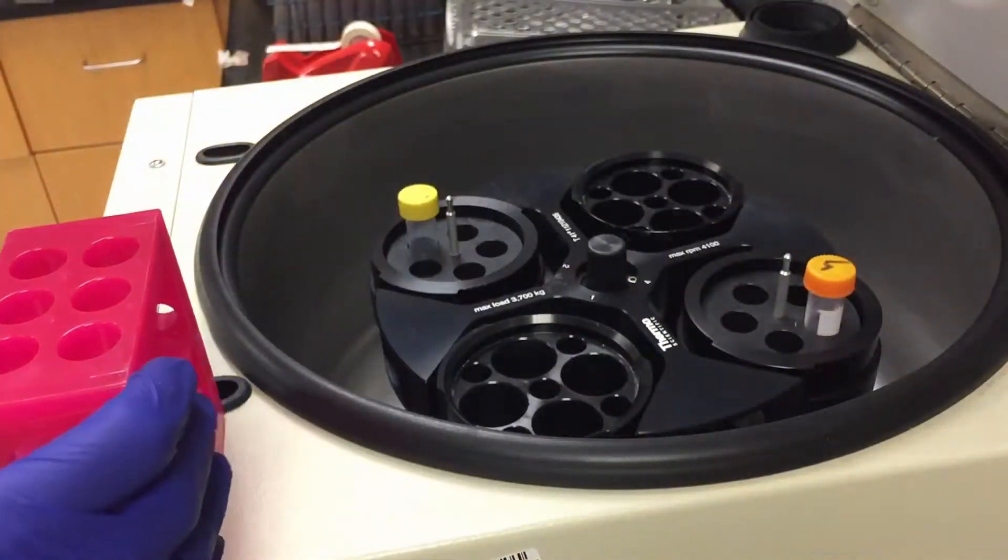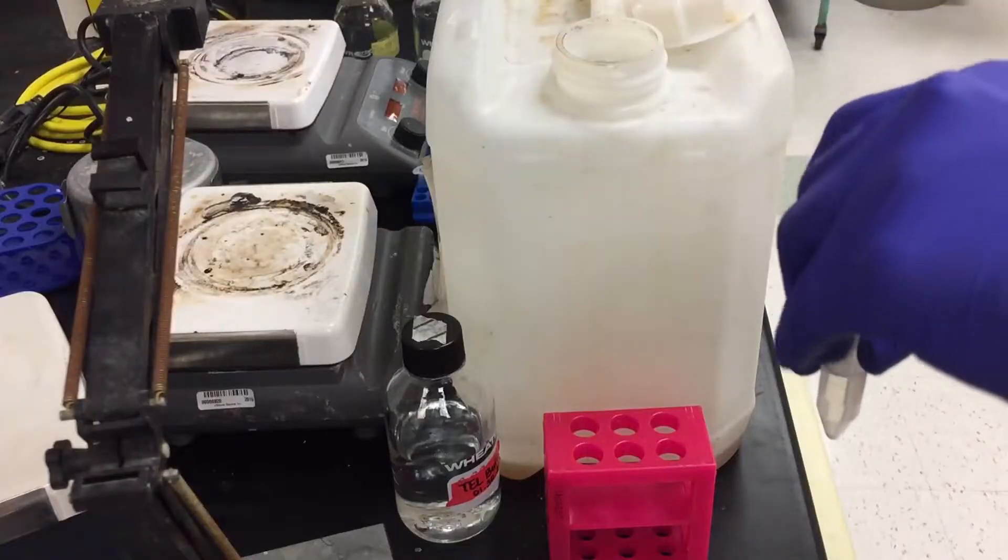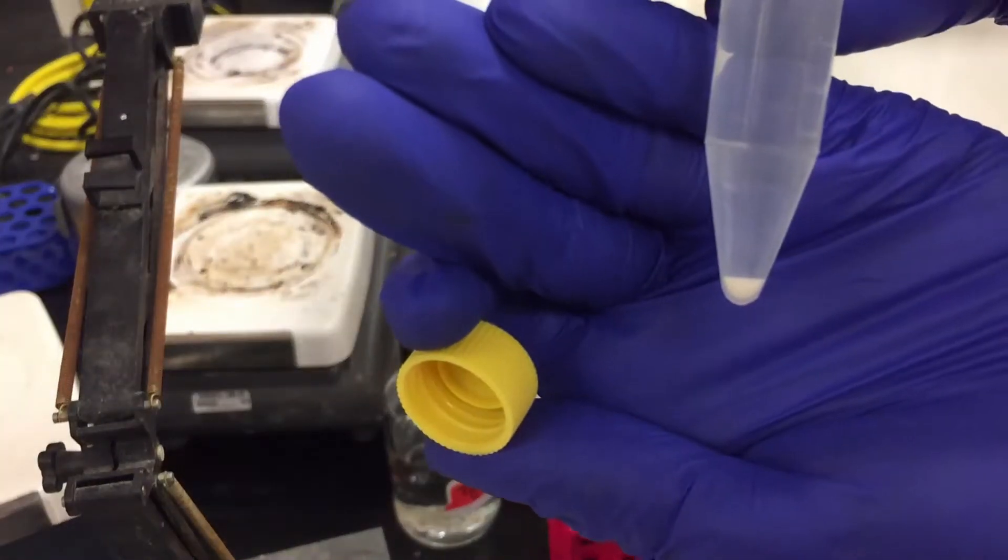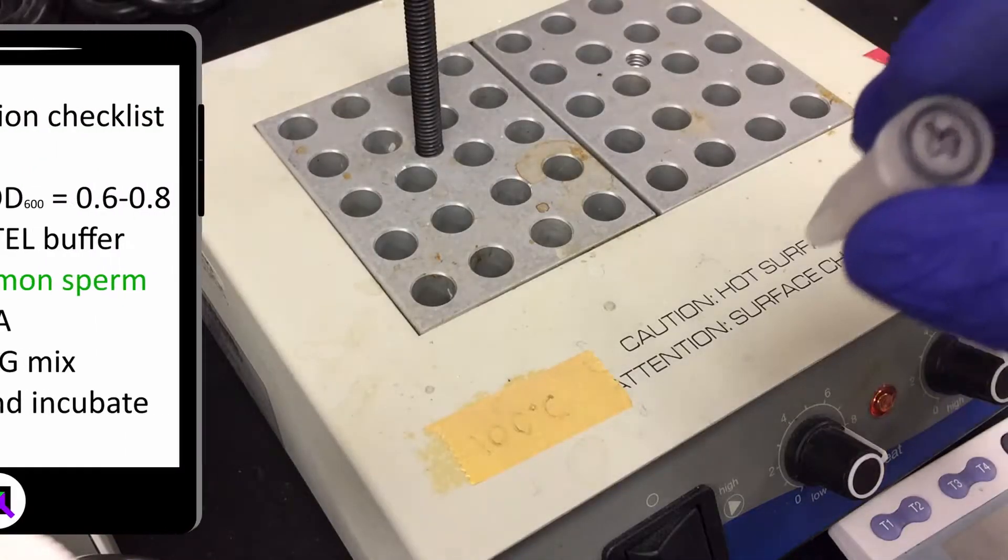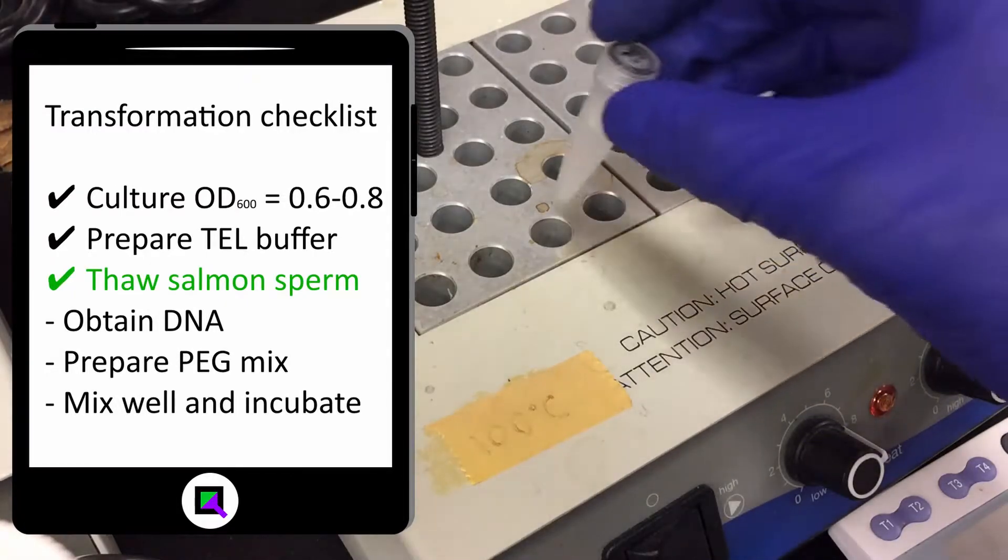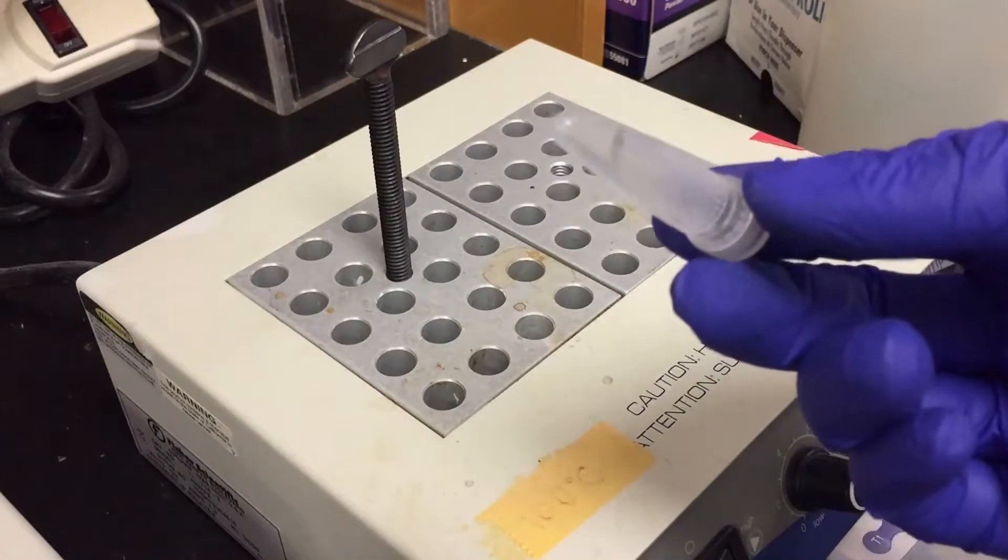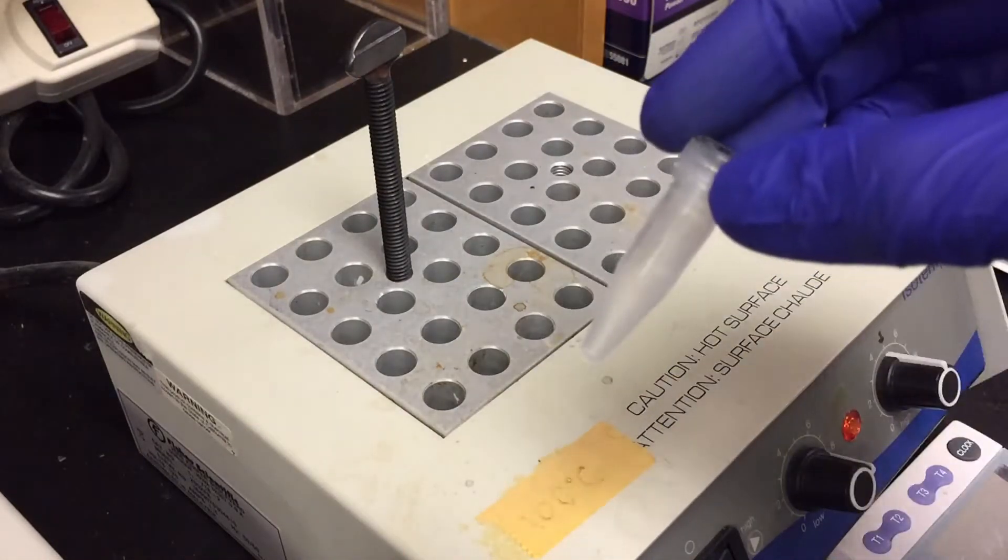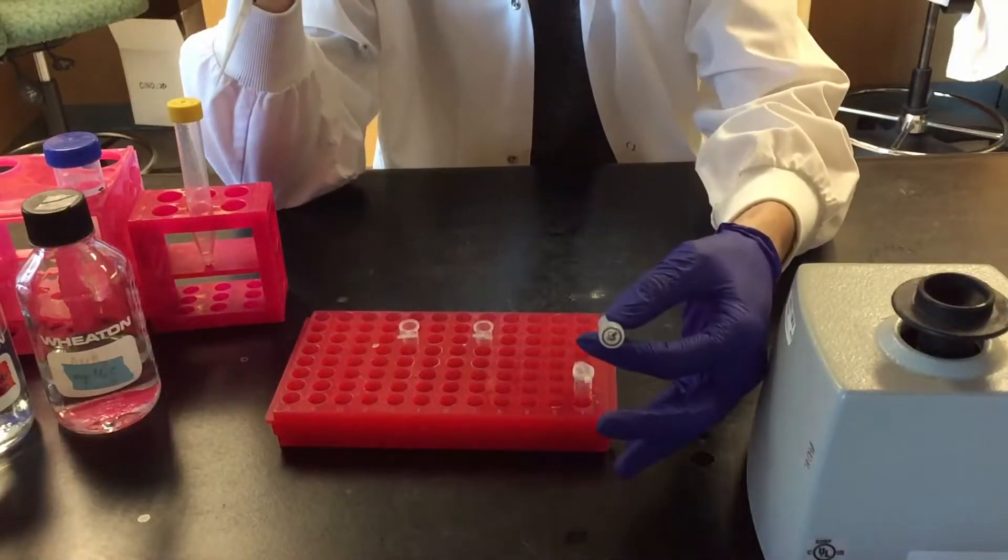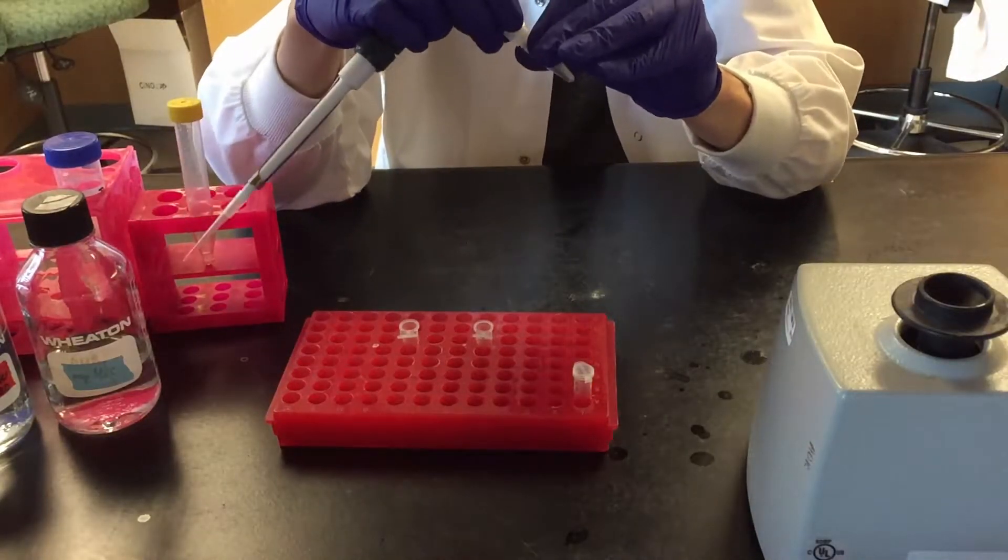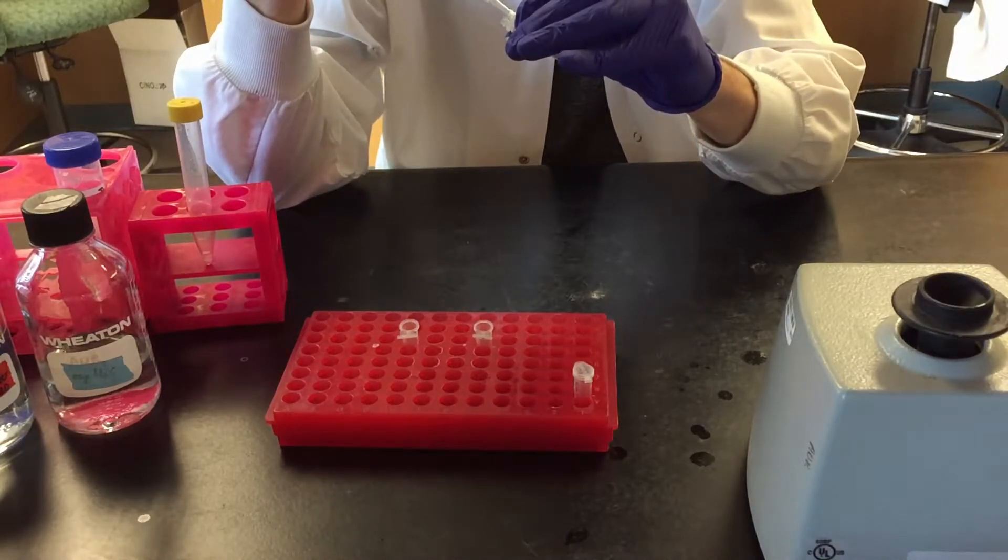Harvest the cells again and remove the wash buffer. At some point during the harvest, thaw salmon sperm DNA at 100 degrees. Add 35 microliters of salmon sperm to each tube after it has cooled again.